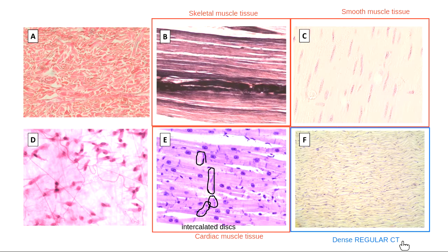What about the ways we distinguish between them? The biggest way, the most important way that we distinguish between them is by looking at the dark spots that are in each of these kinds of tissues. When I'm talking about smooth muscle tissue, my dark spots are going to look much larger, or maybe more puffy might be a way to describe them. So notice when I look at these how they've got some width to them. Because when I go down here to look at my dark spots in dense regular connective tissue, these dark spots are squeezed really flat and really small.